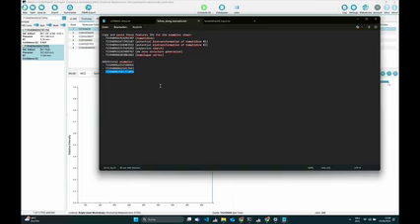Yeah, so we basically have an automated preprocessing, right? And so we just lower the thresholds for the noise and some other things. The usual noise detection would filter very low abundance features out, and in case you are dealing with a specific data set where it is important that we do not do that, in a preprocessing-focused tool like MZmine you would adjust it by yourself. Here we basically have these two modes: do it normal, or do it very, very sensitive.